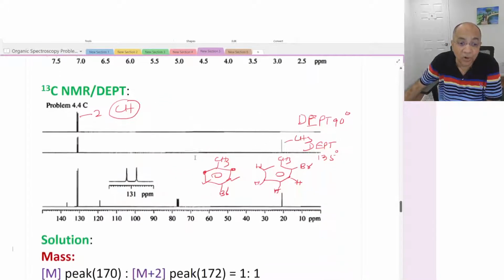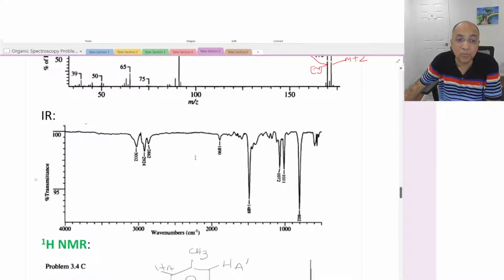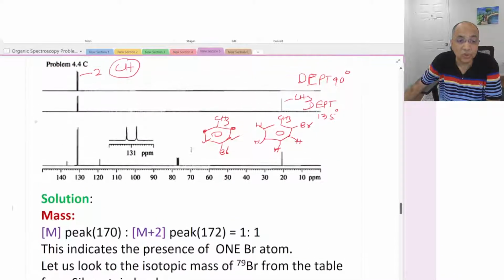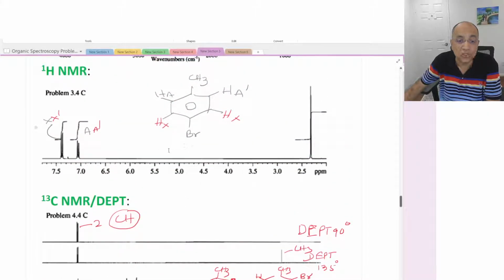Had it been a double bond, then there would be proton NMR data between 4 to 6. So there is no proton NMR from 4 to 6. So a vinylic proton is absolutely not a possibility, only aromatic CH.